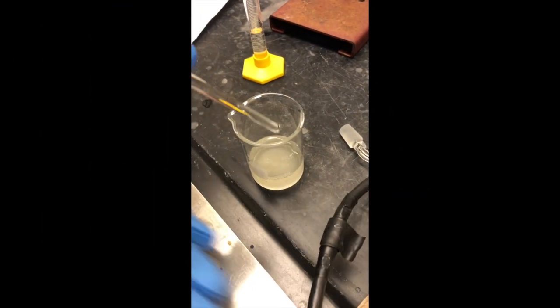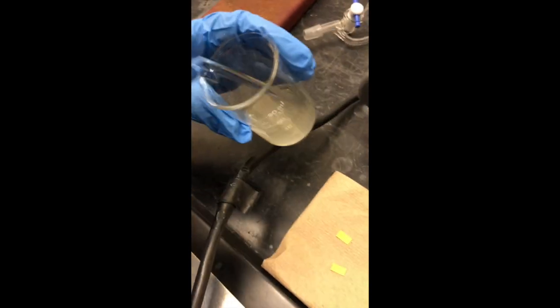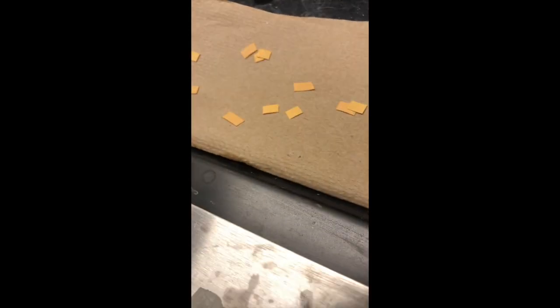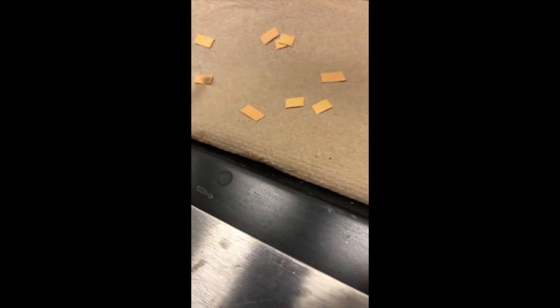Now that we've gotten all the magnesium strips out, we've put the two-layer solution back into a beaker and we're going to test that lower layer's pH. It's a little greenish, which basically means we have a basic solution — not too basic, but just a little basic.